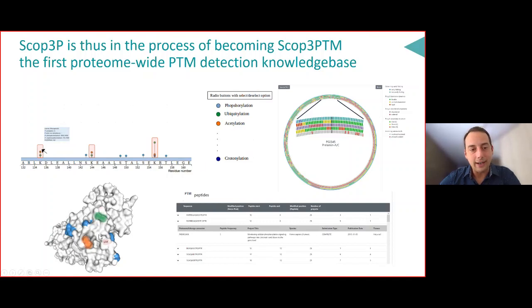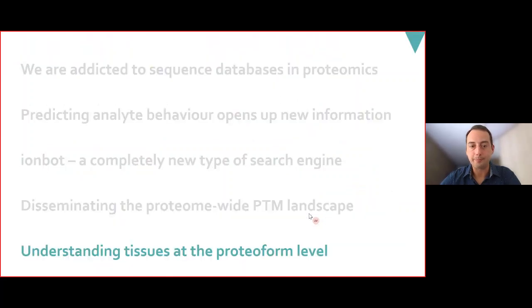And then you can highlight residues based on color for different modifications. And of course, you have all the biophysics and you have the mapping with Swissprot. So we're hard at work at doing that for about the 2.8 to 3 billion spectra that we have for human data. And that's going to come out in the next months. So that is something we are hard at work on right now, which is very exciting.